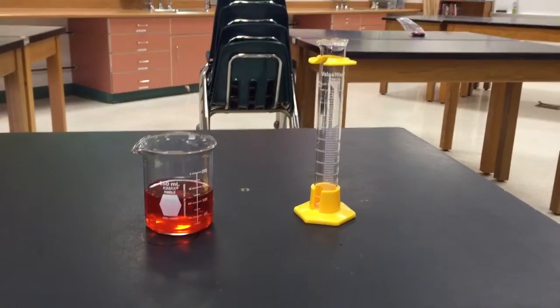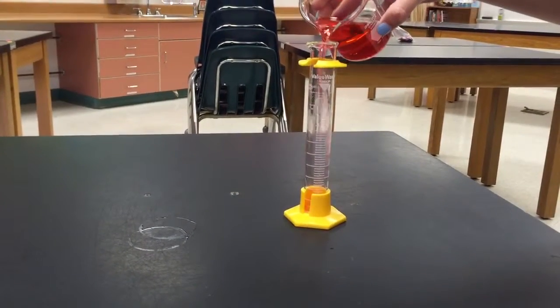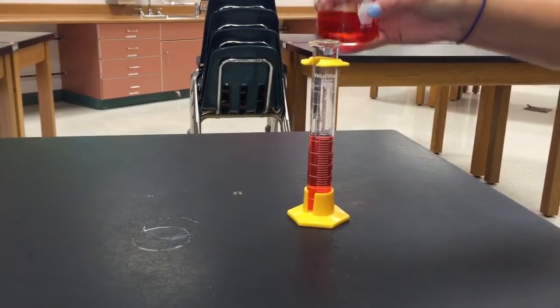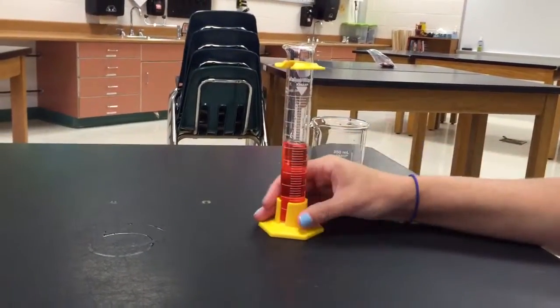We're going to practice one more time exactly how to read a graduated cylinder. I'm going to take my liquid and pour it into my graduated cylinder. I want to make sure that my graduated cylinder is on a flat surface.